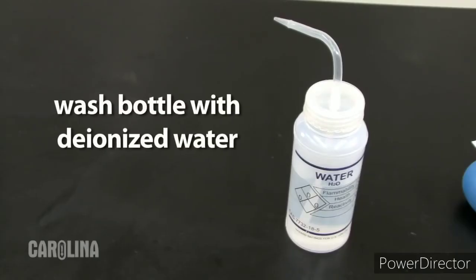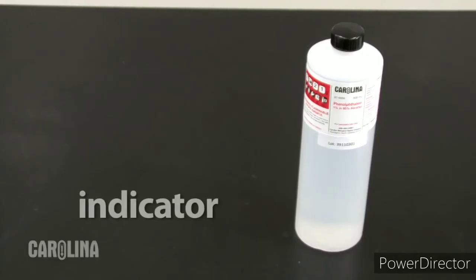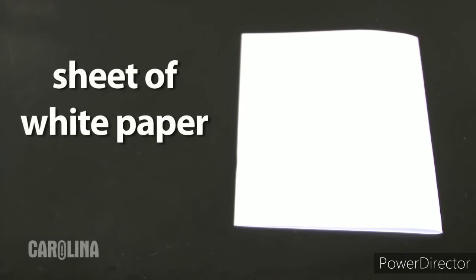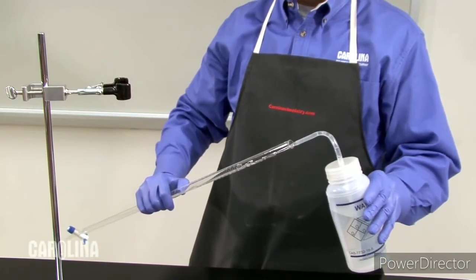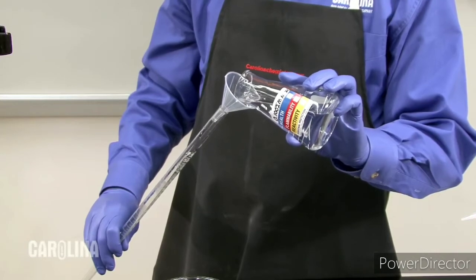A wash bottle filled with deionized water, a beaker or flask of titrant and of analyte, indicator selected for your reaction, a reading card to help read the meniscus, and a sheet of white paper to help visualize the endpoint. To prepare your burette for the titration, it is good laboratory practice to rinse your burette thoroughly with deionized water, then with a small amount of titrant.